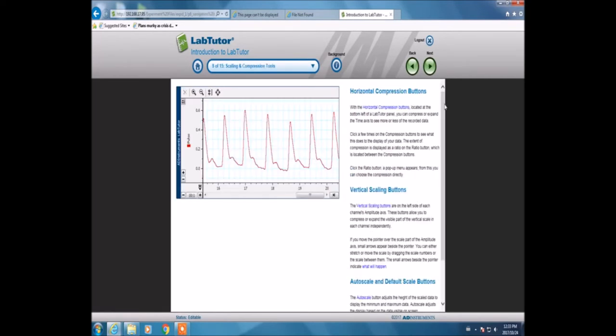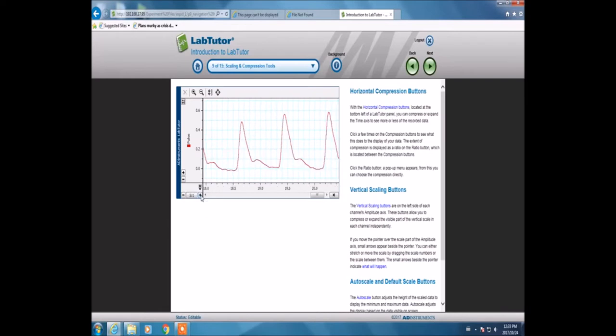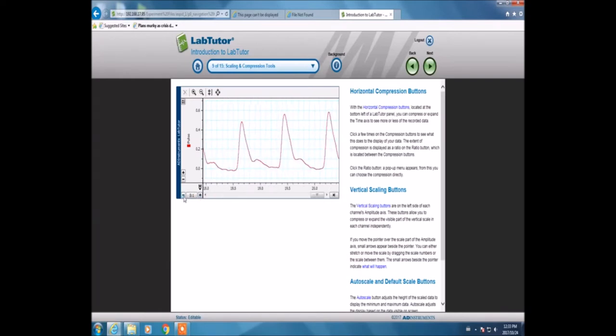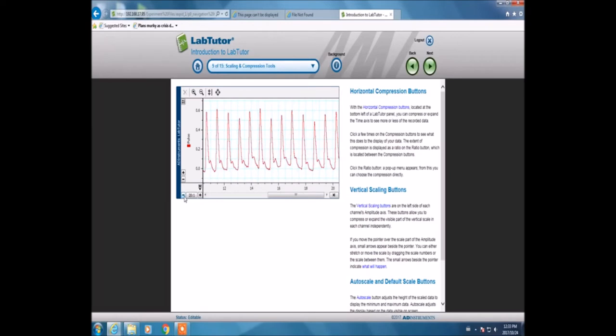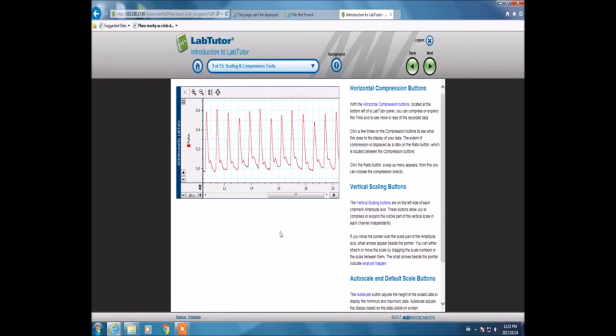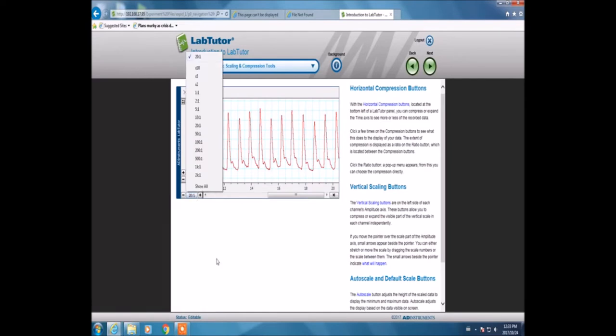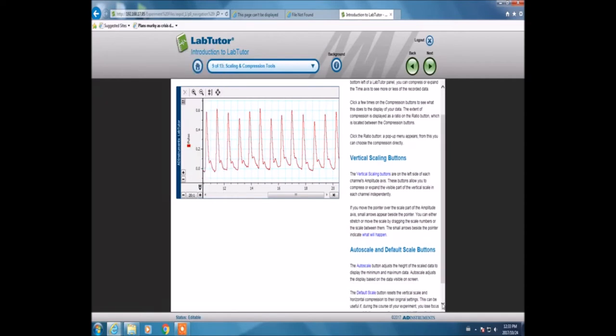We've got different scaling here. We'll start with horizontal scaling. I'm increasing and decreasing the scale. There are also preformed scales that we could use. You could select any of them and get different shapes—you can increase or decrease it.